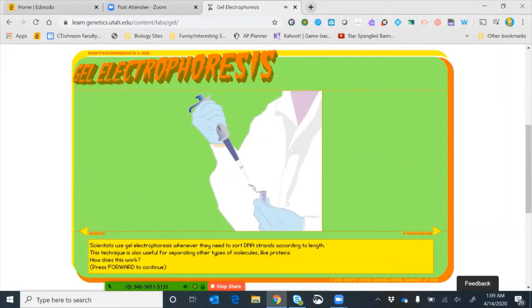Scientists use gel electrophoresis whenever they need to sort DNA strands according to length. The technique is also useful for separating other types of molecules like proteins. Notice this tool here — the micropipetter — hopefully you've already become skillful at using this earlier this semester.